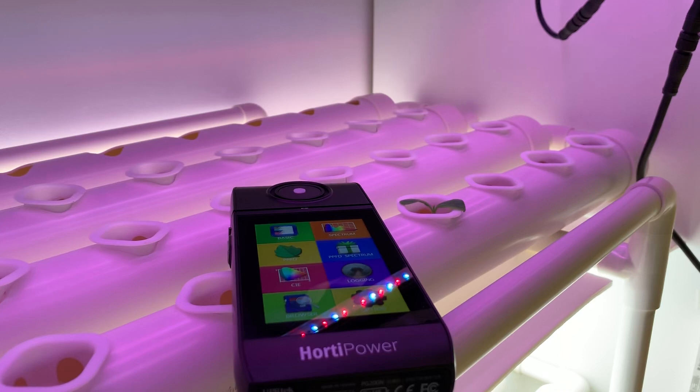Hello, this is the HortiPower Spectrum Meter. If you ever wondered whether your plants receive enough light or the right kind of light, then you may need this tool. This is the tool to help you understand exactly what's going on in terms of light.